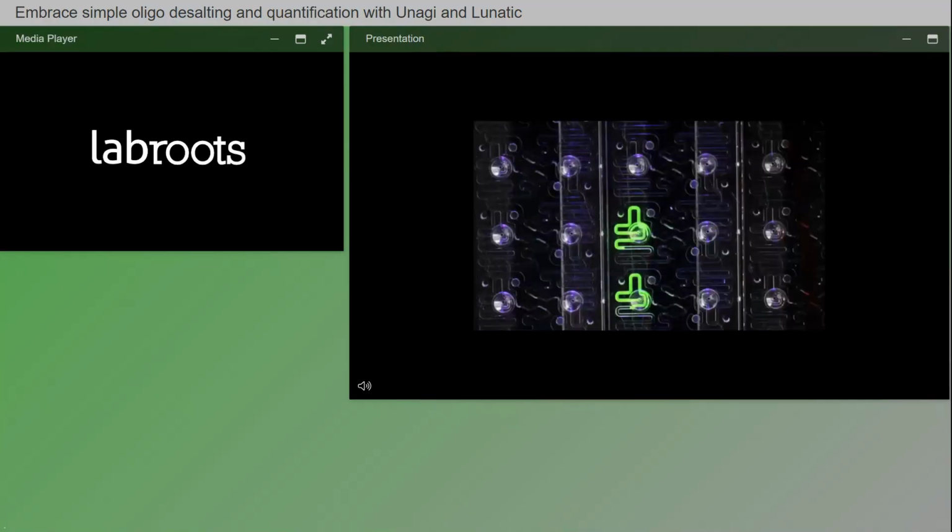To show what this looks like, this video is in real time, where we added some fluorescein and we're using black light to visualize things. So, Lunatic's not a fluorescence reader, but this really helps us see what happens on video. You can see I added 2 microliters of sample to that well, and it gets wicked into the sample volume just that fast.